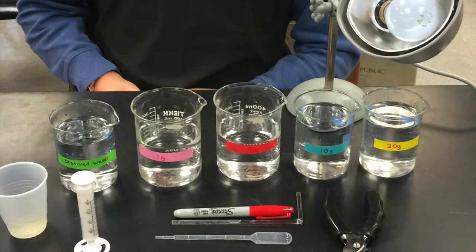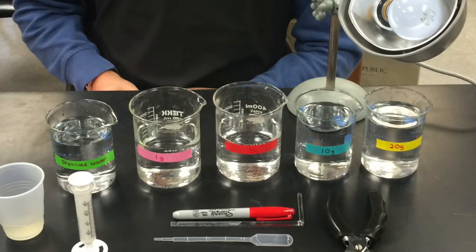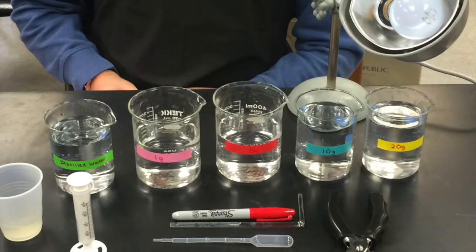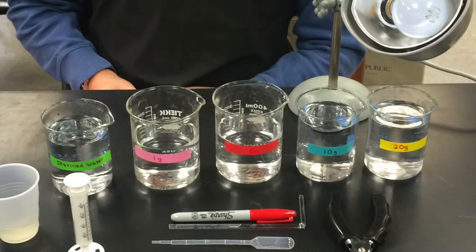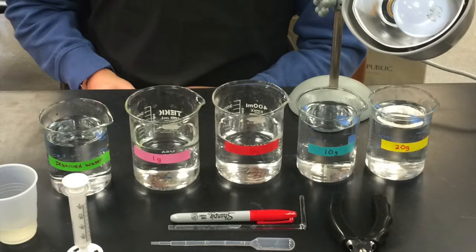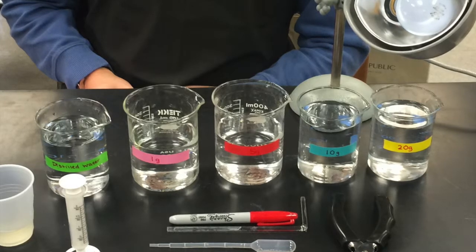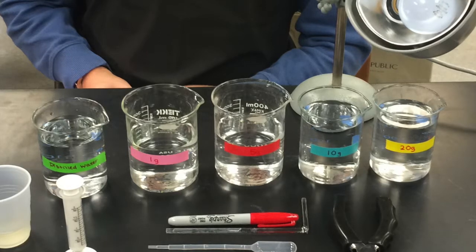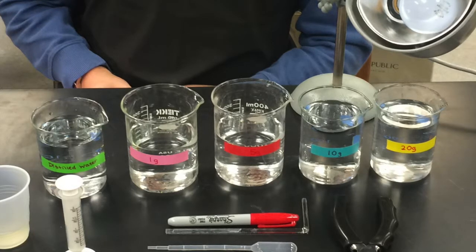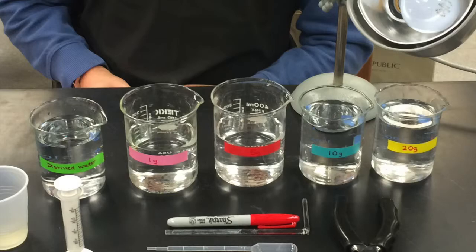We set up our experiment with 4 different solutions, each with 1, 5, 10, or 20 grams of baking soda and 250 milliliters of distilled water, and 1 control group with only distilled water. The materials we used to conduct this investigation include different solutions of CO2, 10 discs of spinach leaves for each group, a hole puncher, syringes to remove gas from the leaves, diluted soap, and 2 lamps.